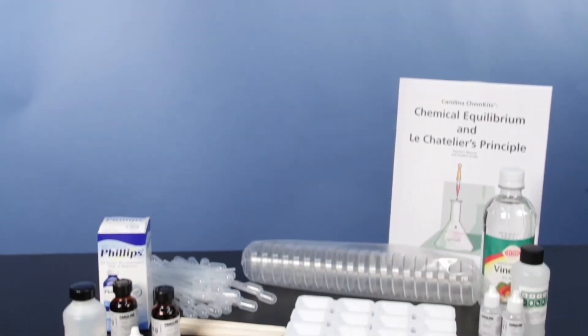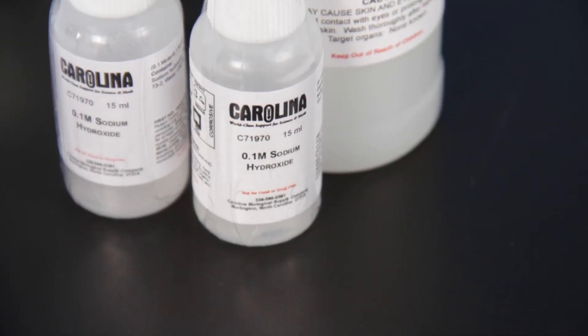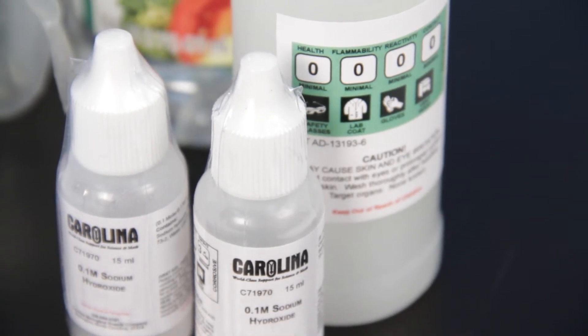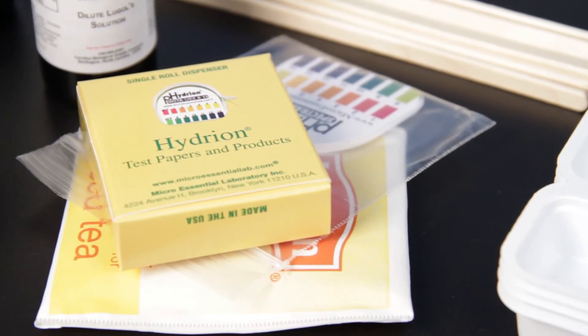Observe dynamic equilibrium and Le Chatelier's Principle in action with the Chemical Equilibrium and Le Chatelier's Principle Chem Kit. Students study four different reactions and investigate how equilibrium shifts when they introduce stress to a reaction.